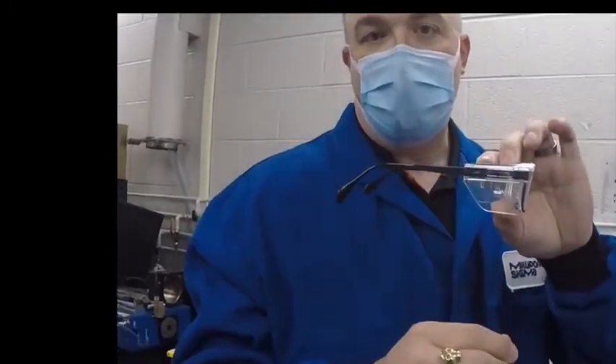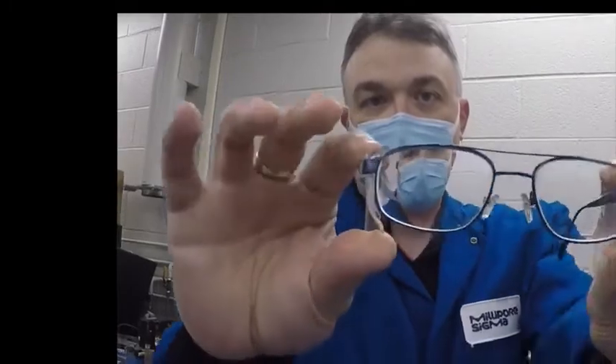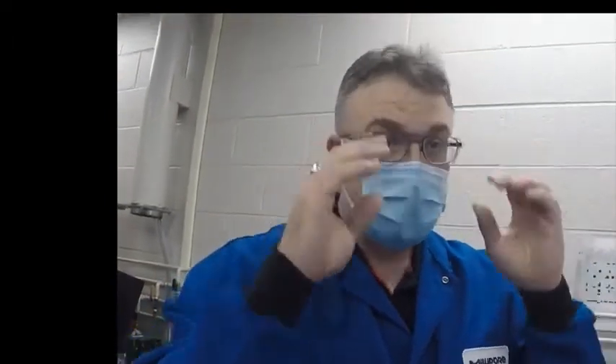If you have a prescription, your safety manager can provide you with prescription safety glasses. Prescription safety glasses must have permanently fixed side shields and be rated for strike resistance — you'll see a mark on the side indicating they are strike-resistant glasses. Again, please check with your safety officer to provide you with the correct glasses for your situation.